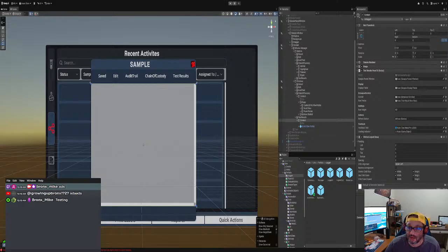For the columns, this is going to be the actual columns: the test name, the result value, the unit, reference range, status, and flags. Now down here, we're going to have the test result data, which is going to extend to what we want, because every sample type is going to have a different test type, and it's going to get confusing.